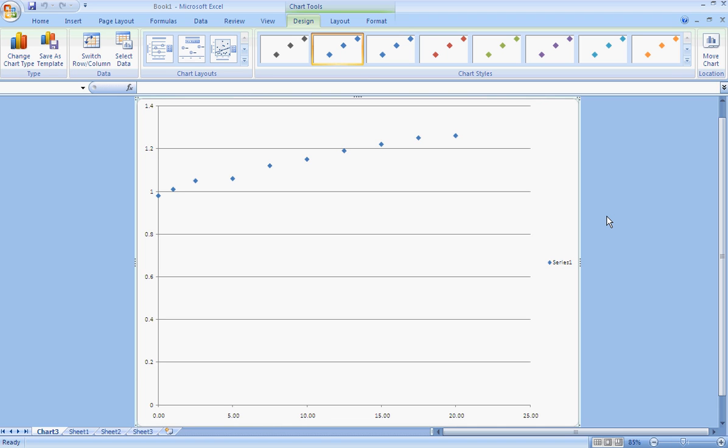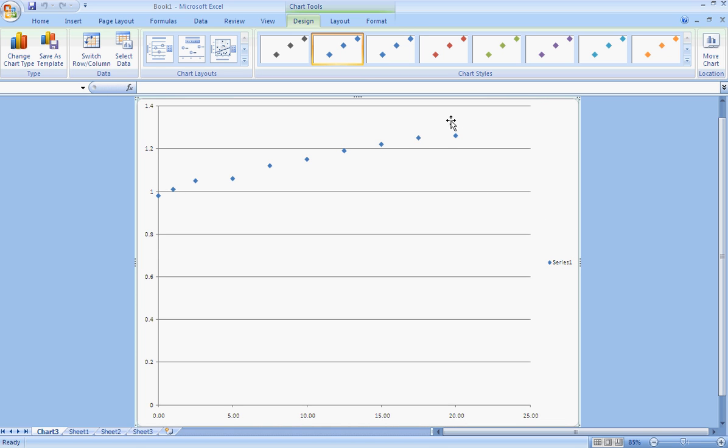Right now, I'm almost finished, but I just want to format this so it looks a little bit nicer. One thing, it's difficult to read any of the values. The font's awfully small. I also need a line here. I need a linear trendline and I need the equation of that line.